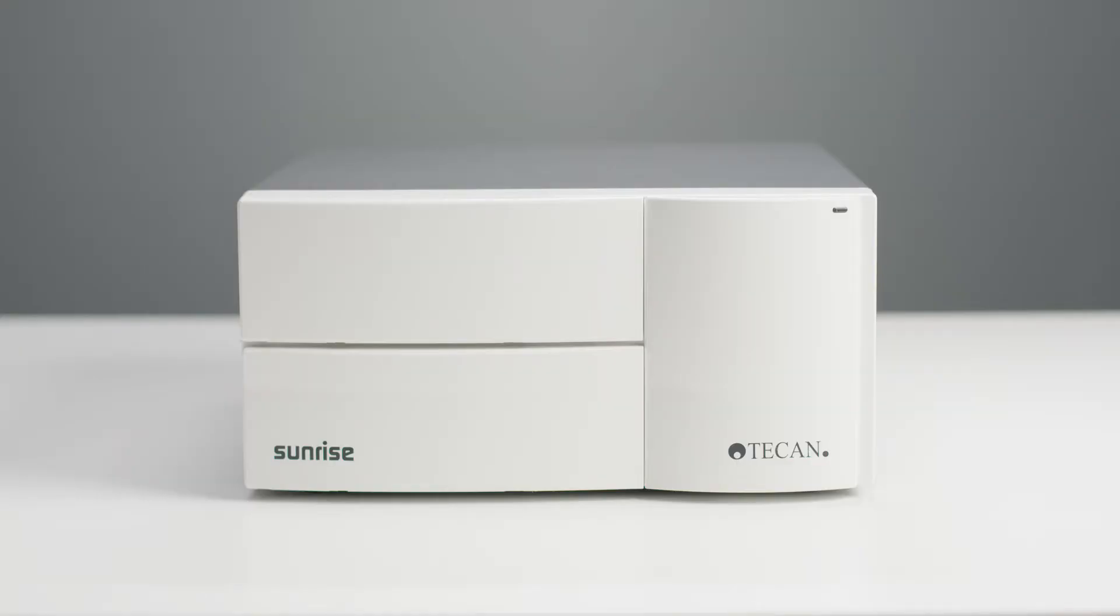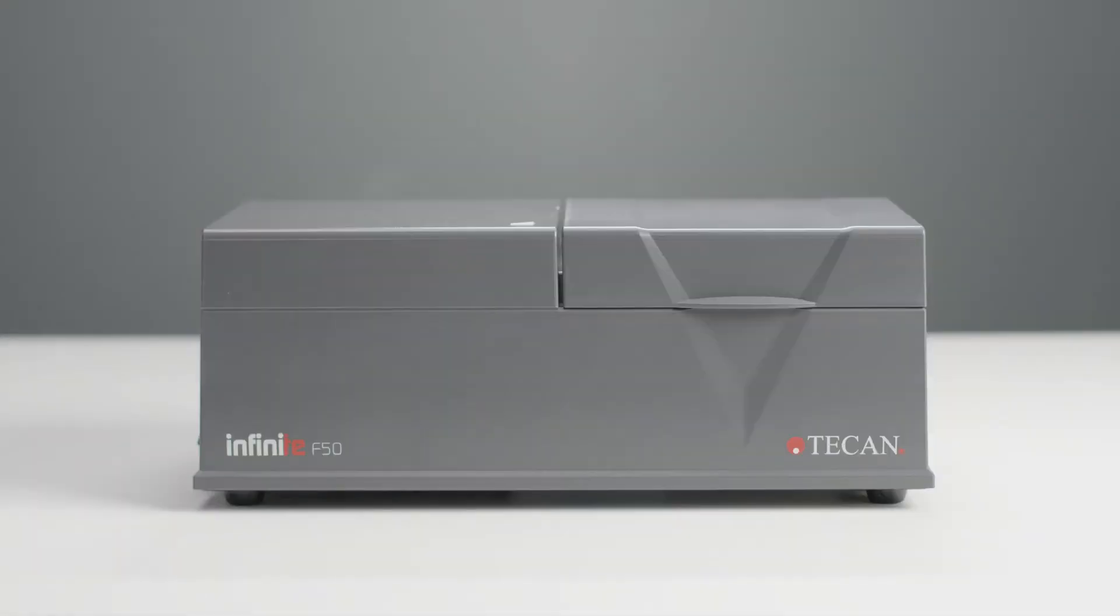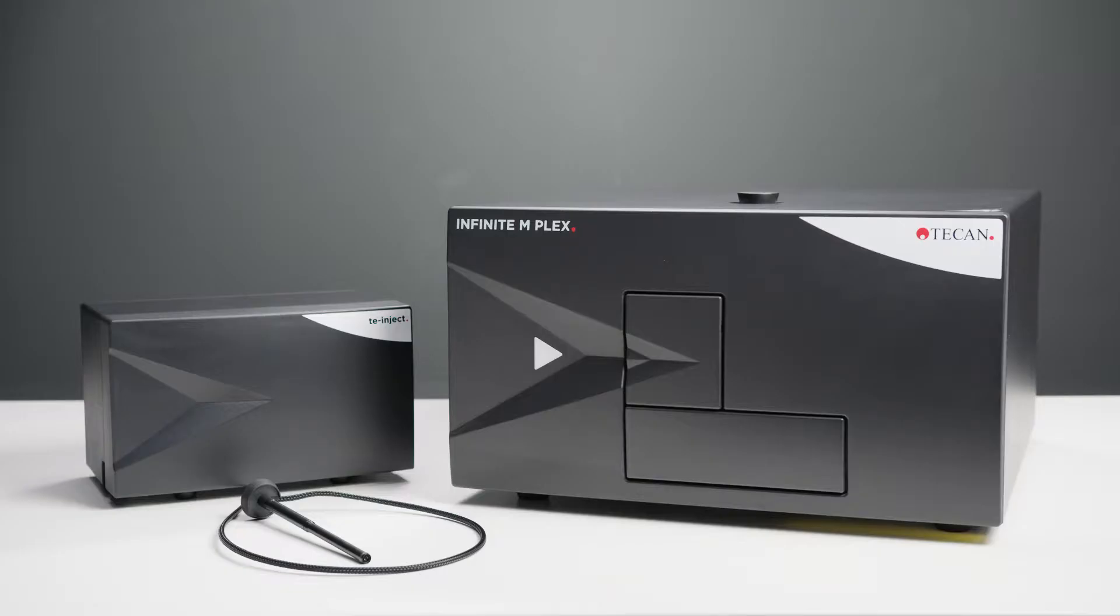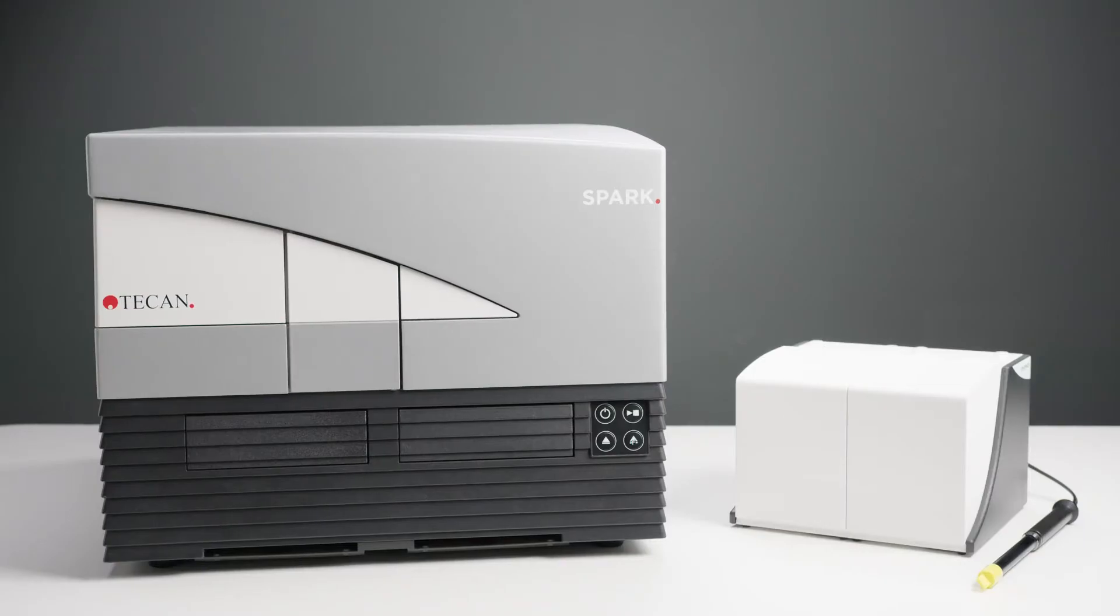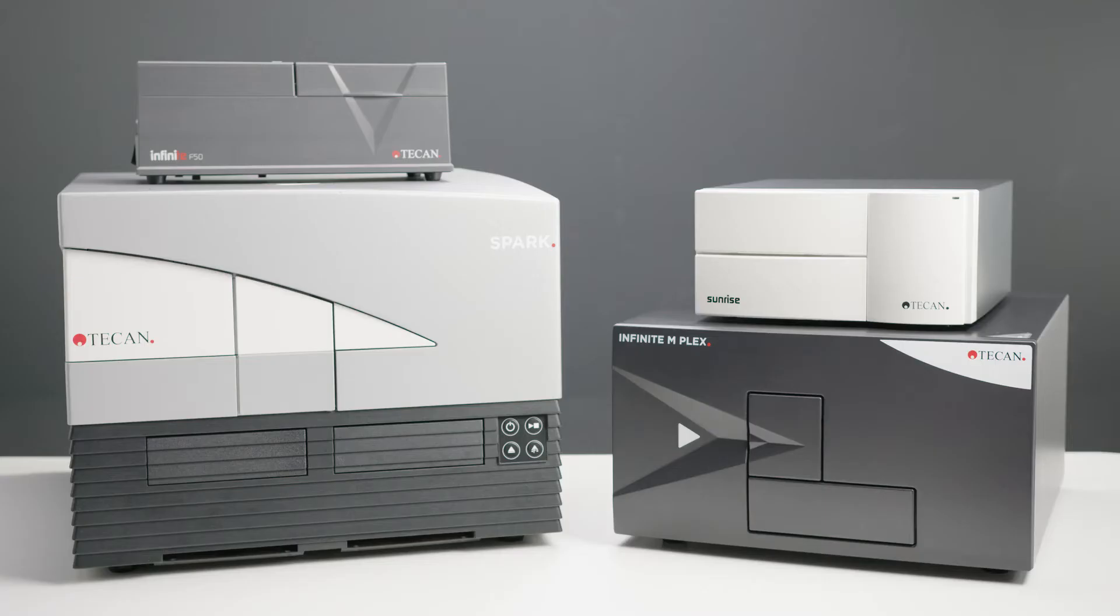This includes the Sunrise, the Infinite F50, the Infinite 200 Pro, and the Spark. If you have any questions about installing your instrument, check out the respective tutorial.